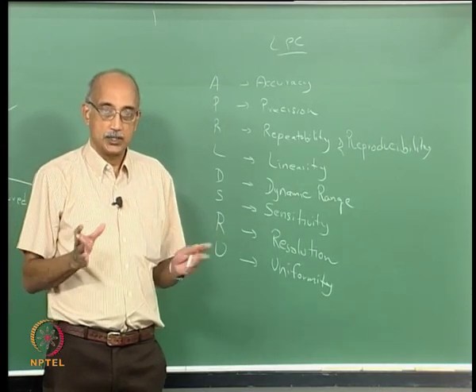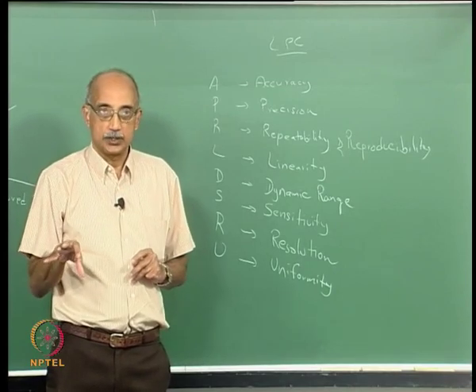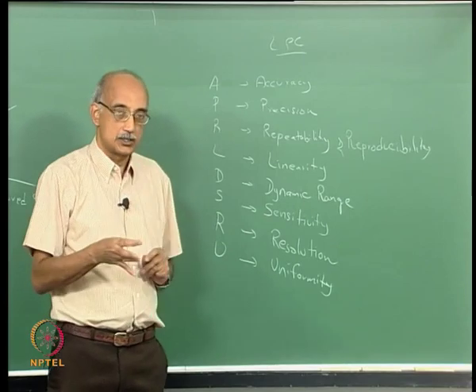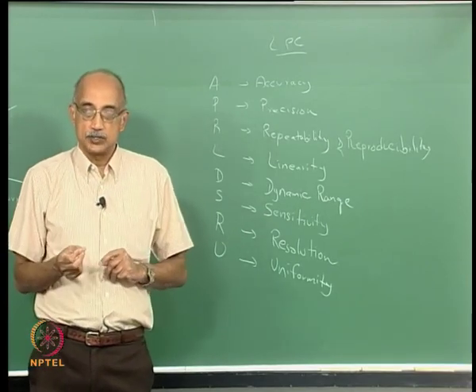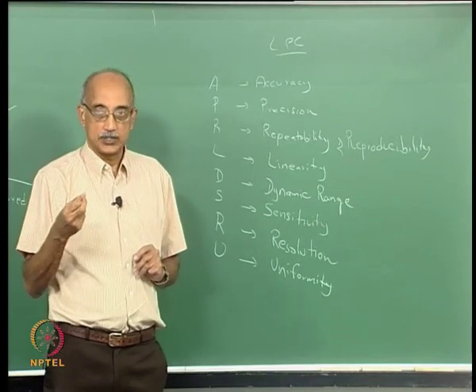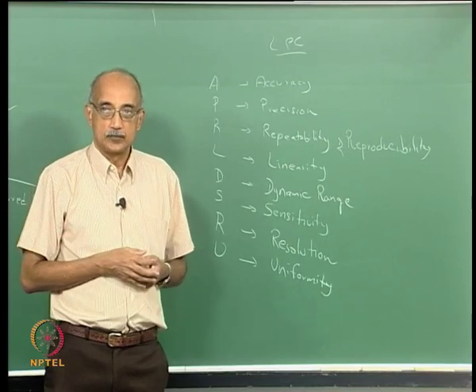The gauge capability includes repeatability as well as reproducibility, and it's typically expressed as a percentage. The gauge capability of an instrument must typically be better than 10% of the signal, otherwise it's not considered an acceptable value.